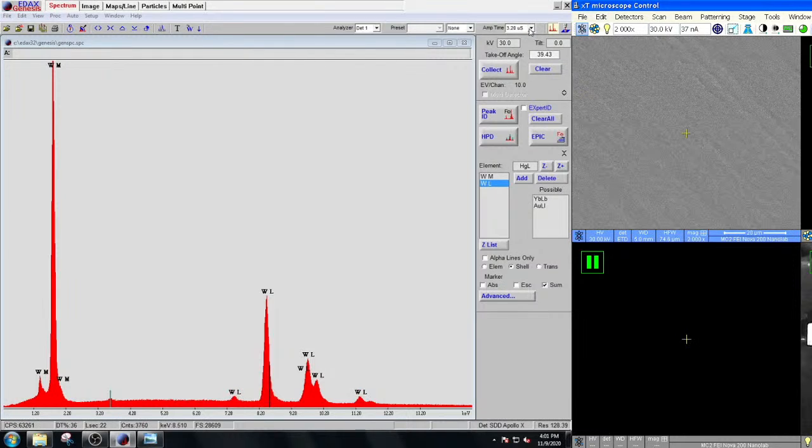Some of you are probably going to ask, what is dead time? If you've never heard about it, dead time is the ratio between the collecting time of the EDS detector versus the non-collecting time, or the counting time. The way this works is that the EDS detectors cannot measure the energy of an X-ray photon while they are collecting X-ray photons. So we have some certain count rate down here, right?